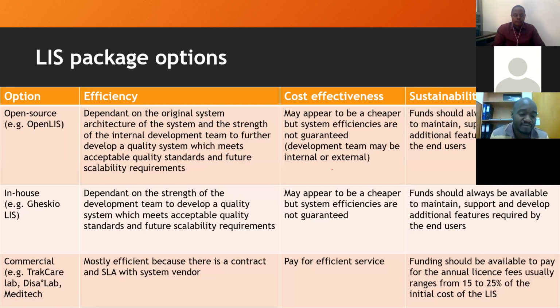Right, so there are different options that exist. You've got an open source LIS, an in-house one, or a commercial package. We tried to differentiate them based on efficiency, cost effectiveness, and sustainability. If you look at the open source and in-house options, those are mainly dependent on the developers that you have in-house, because when you get an open source application, going forward you would need to customize it. You need to configure it according to your requirements.